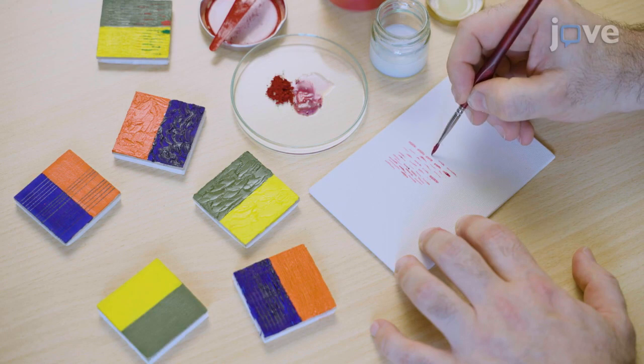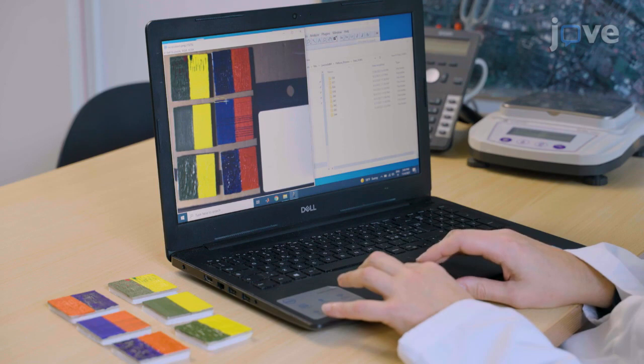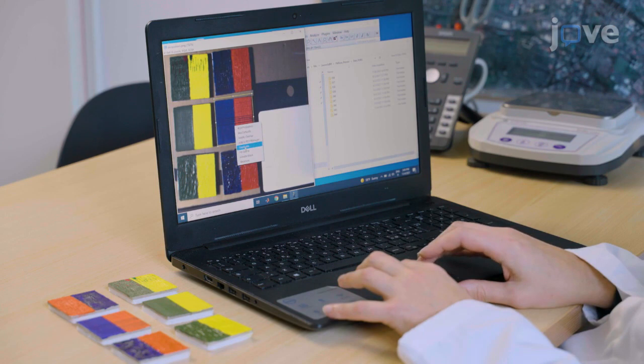Acquire the hyperspectral data and check whether the spatial resolution of the hypercubes can distinguish the different brush strokes on the RGB images of the painted surface.